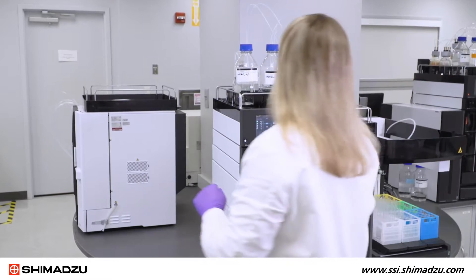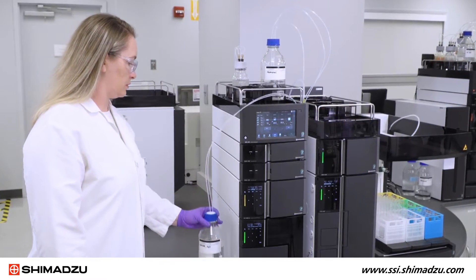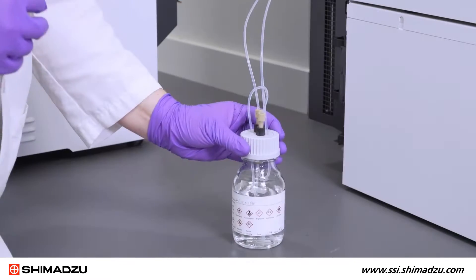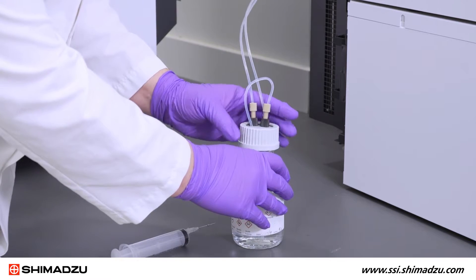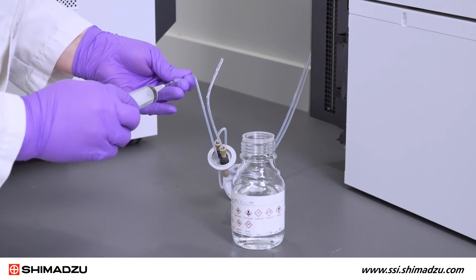Before you begin, place the reservoir with the mobile phase solvent lower than the pump inlet. This will prevent the solvent from flowing out of the suction tube or pump head. If the seal rinsing kit is attached, remove the cap from the rinse solution bottle and remove the rinse solution from the flowline using a syringe with a needle.